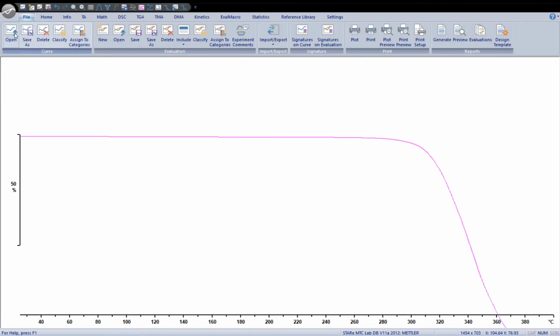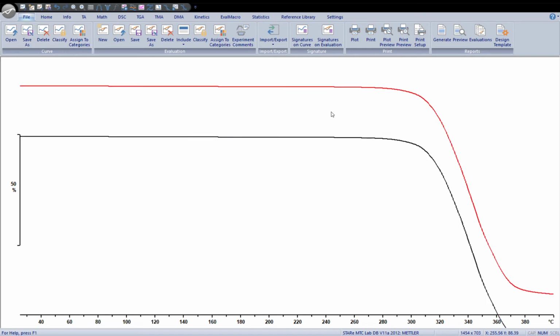So I'm going to go to the Open Curve menu, choosing File, and then in the Curve section, clicking Open. Then my curve list will come up, and I'll select that curve out of my list and hit open, and there, boom, I've got 2 copies of the same curve. Let's say I want to move the red one into an inset box. The way to do that is to just draw a box where you want the red curve to go, and then I know my screen recording software doesn't show the menu when I right click. So you just got to trust me.